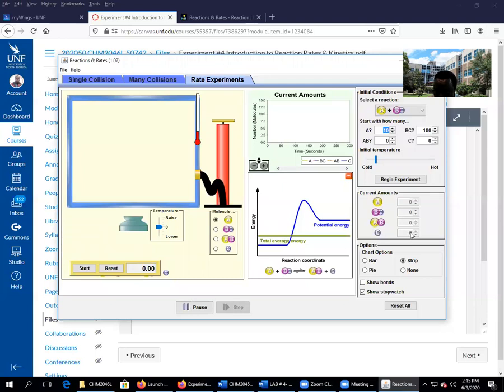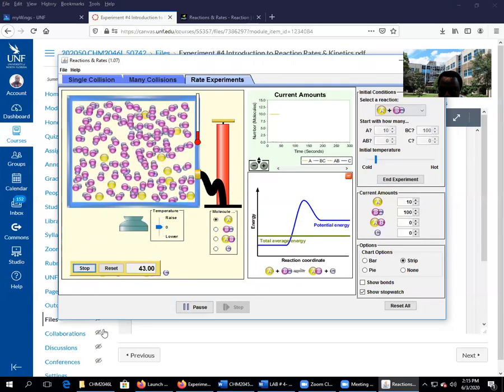Once you see this value is 5. Right now it is 0, I have 10, I have 100. So what I have realized is the stopwatch doesn't start right away. So you have to start both of them, it doesn't start by one click. If I click here, the stopwatch will not start. So I'll start begin and then start the stopwatch.